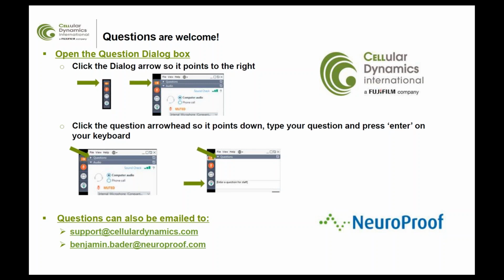And I would say from our customer base, we see that more and more people jump on the human iPS neurons, even as standalone, but several are doing that side by side with rodent and mouse and human models. So I think it will not be replaced completely, but can be used as a good reference model and to judge the quality of the novel human iPS neurons.